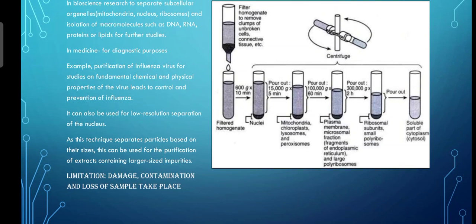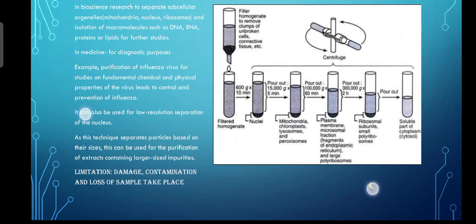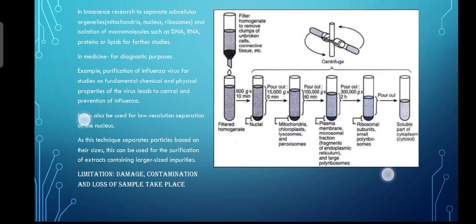For example, purification of influenza virus for studies on fundamental chemical and physical properties of the virus led to control and prevention of influenza. It can also be used for low resolution separation of the nucleus. As this technique separates particles based on their size, it can be used for the purification of extracts containing larger size impurities. There are some limitations: damage or contamination and loss of sample can take place.